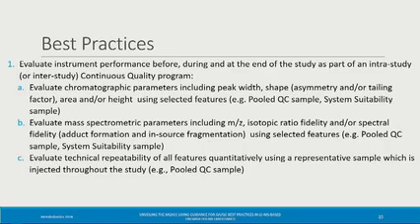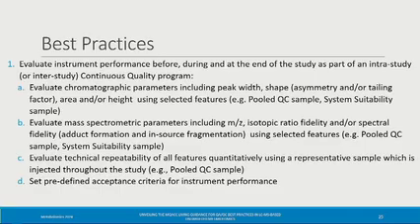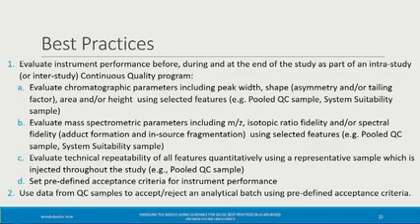It will also be to evaluate the technical repeatability of all features quantitatively, using a representative sample which is injected throughout the study, for example, the pool QC samples. And to set predefined acceptance criteria for the instrument performance. The second best practice is the use of data from the quality control samples to accept or reject an analytical batch using predefined accepted criteria.